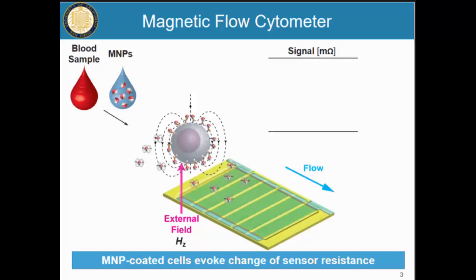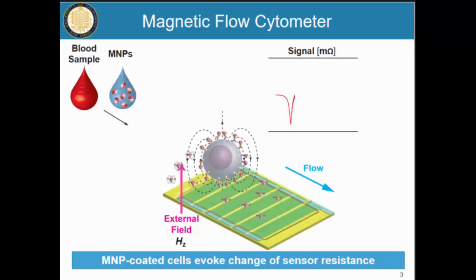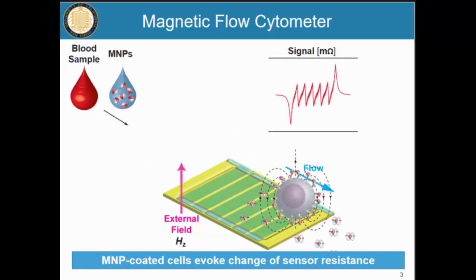We apply an external magnetic field, and then we flow these cells over a sensor, and we effectively measure a transient signal that's due to the presence of these magnetic nanoparticles as they translocate across this sensor. And so we're looking at this magnetic sensor in order to monitor this temporal response as the cells flow past the sensor.